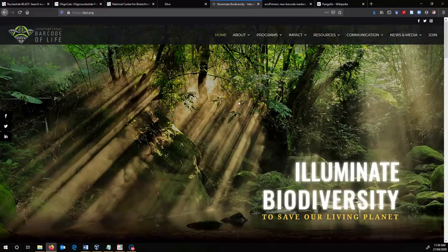But basically what it means is that if you're trying to design a group-specific primer set, like we are going to design for pangolins in a moment, there's no way that you can find invariant PCR primer binding sites. So there'll always be some variation in the binding site, and that makes it very difficult. So I tend not to use this region. Other people do for DNA metabarcoding. It's a personal preference to some extent, but of course I'm right and they're wrong.